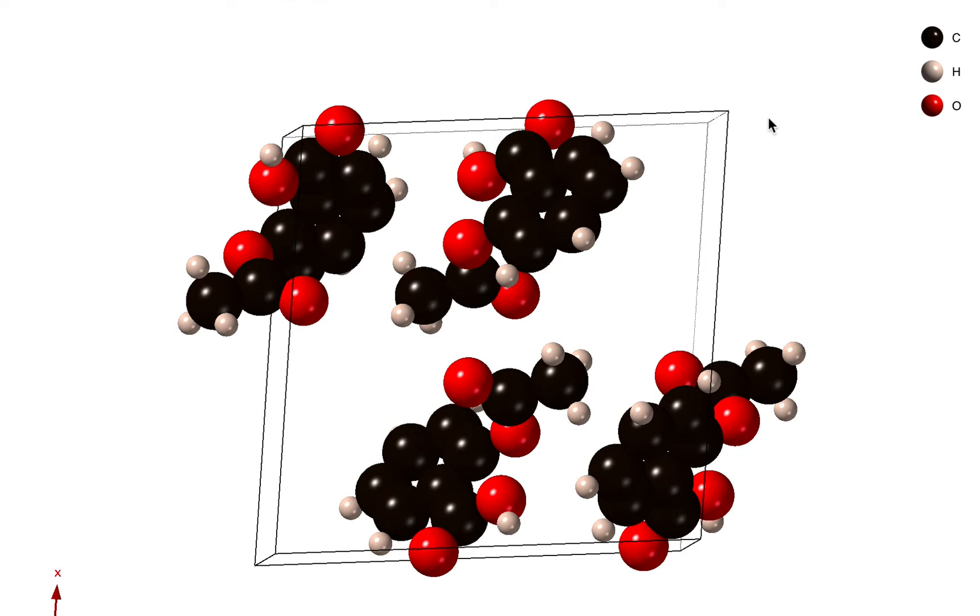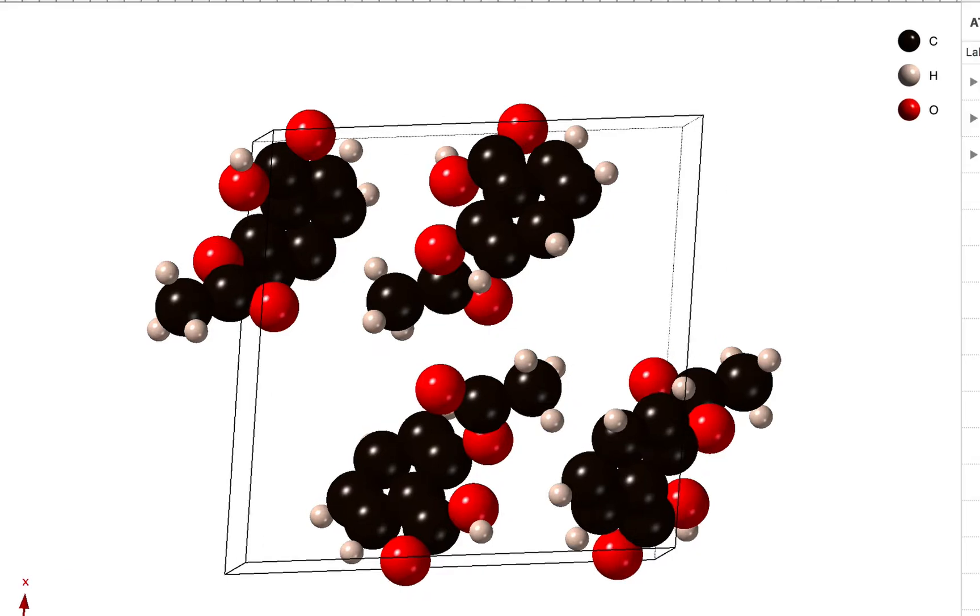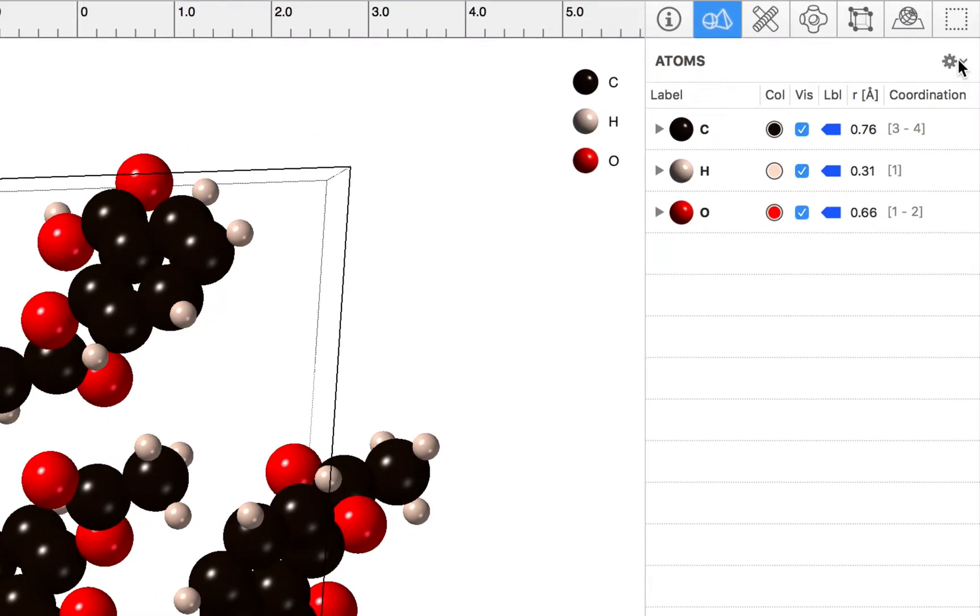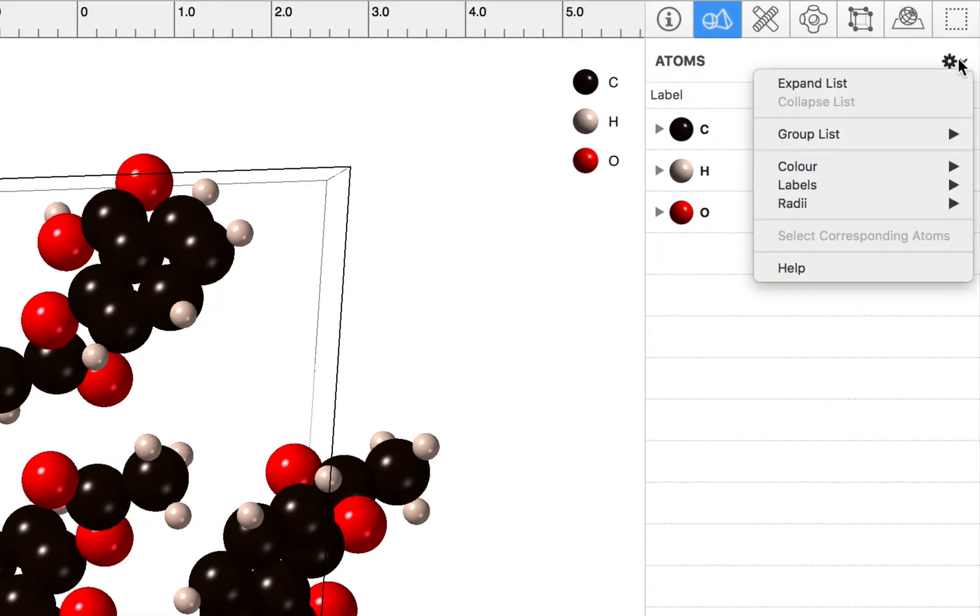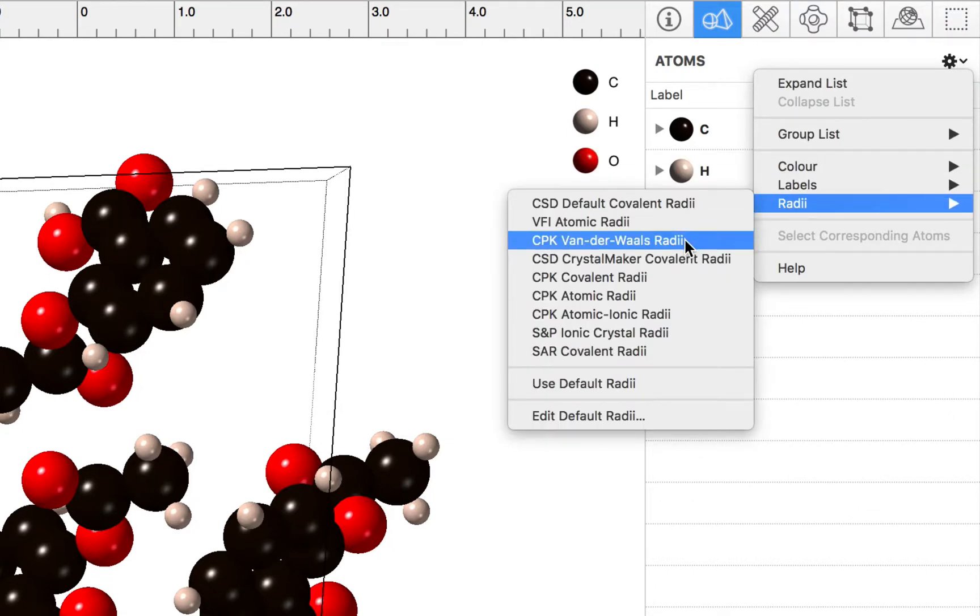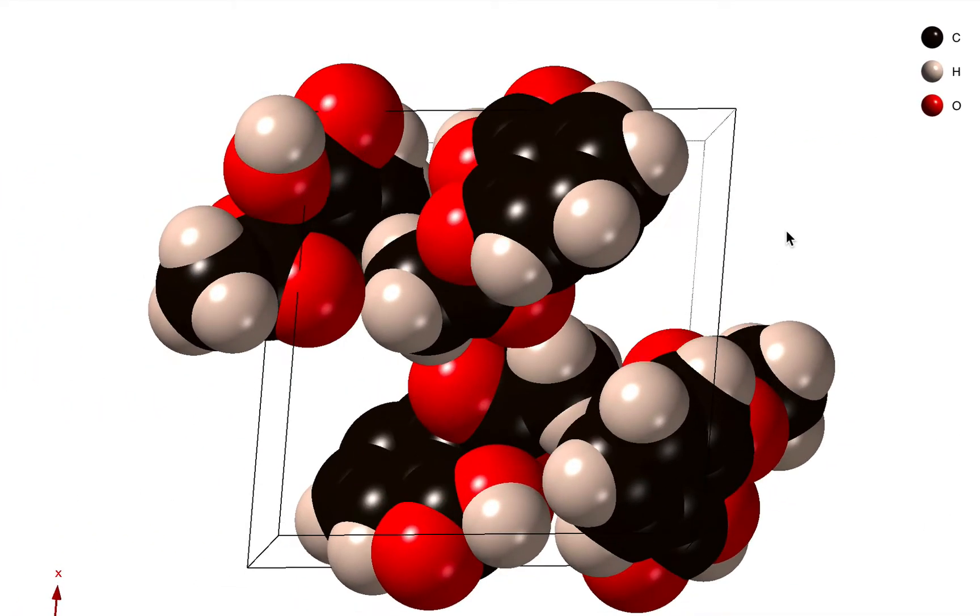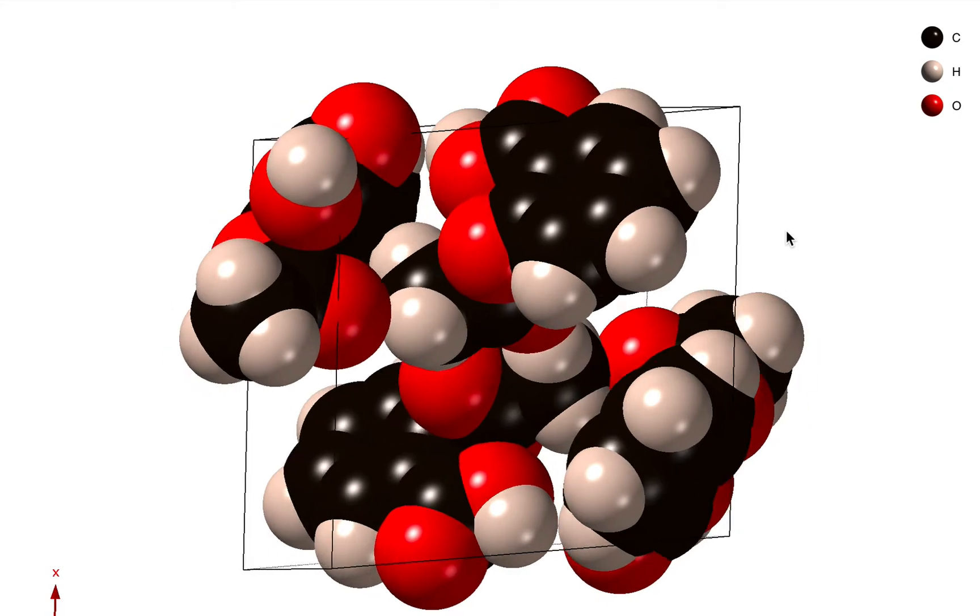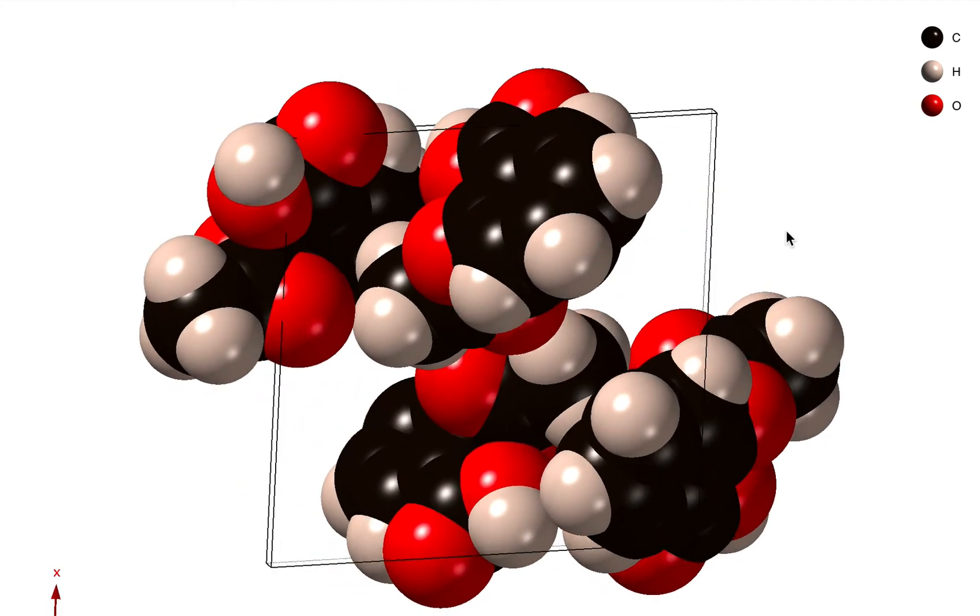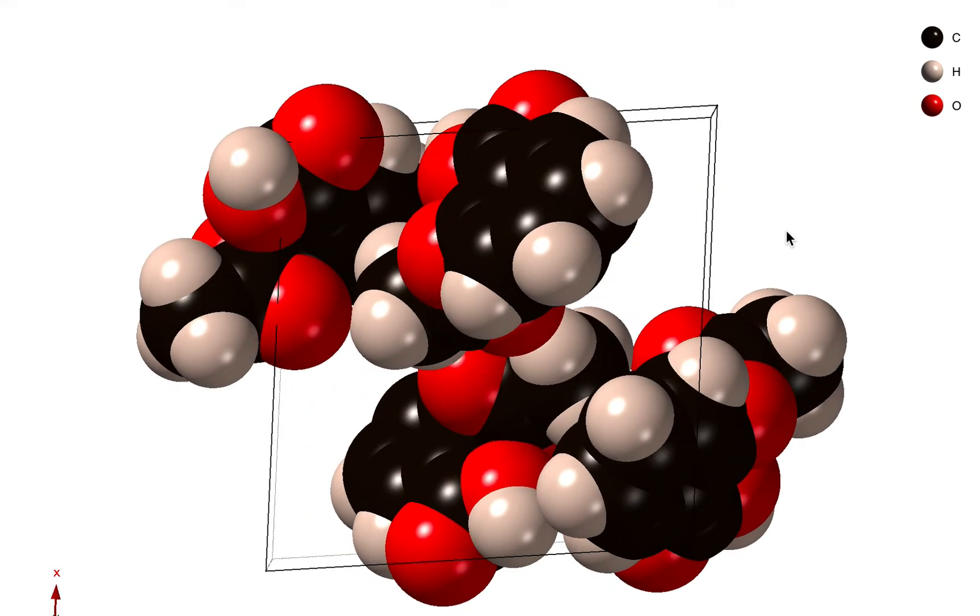You might want to show some van der Waals radii. We can do that by going to this actions menu and we can choose radii van der Waals, and now we can see the sort of interaction volumes of the molecules. Now the problem with this view is that it's so dense you can't really see what's going on.